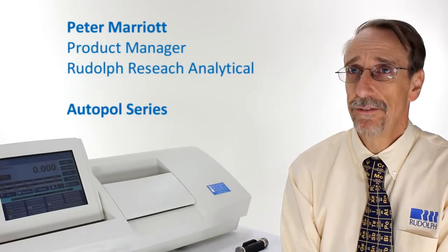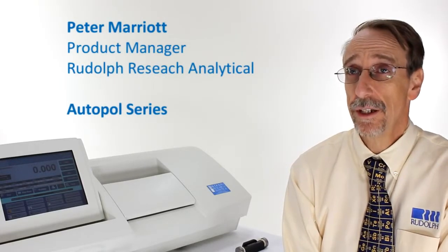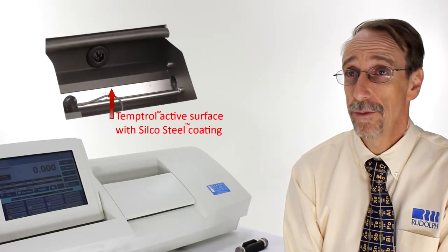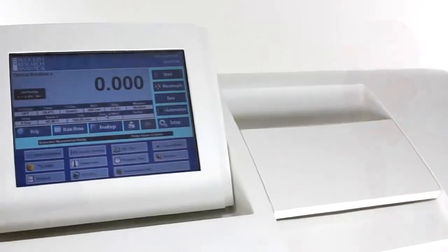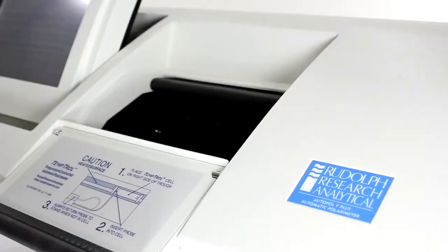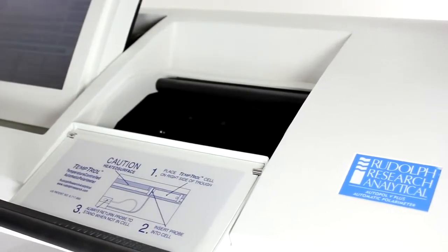This video covers how to fill cells and make measurements using a Rudolph Polarimeter equipped with exclusive and patented Temptrol heating and cooling systems. Although this demonstration is done using an Autopol 5 Plus, the procedure is similar for all models equipped with Temptrol.